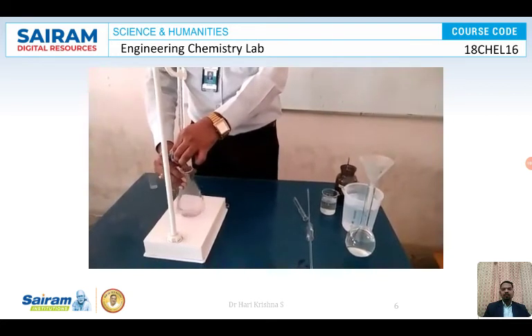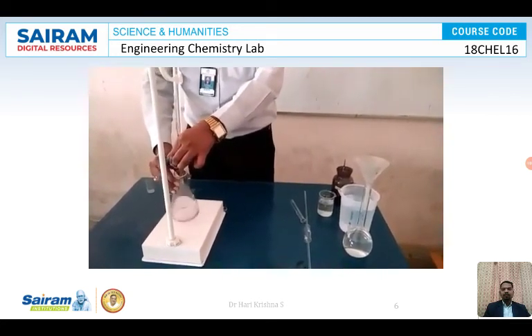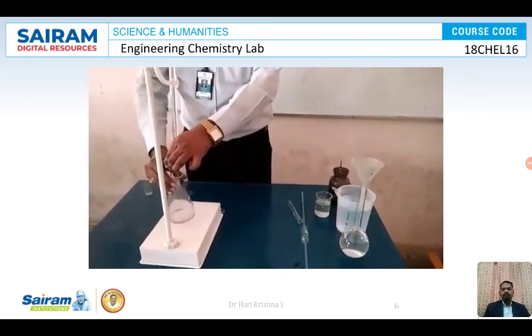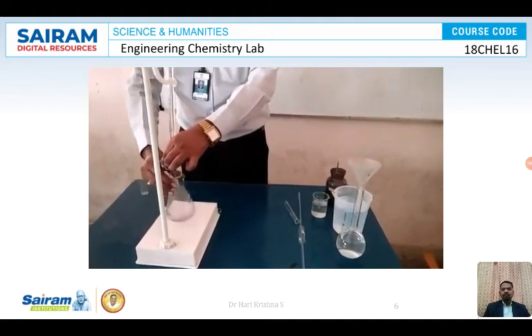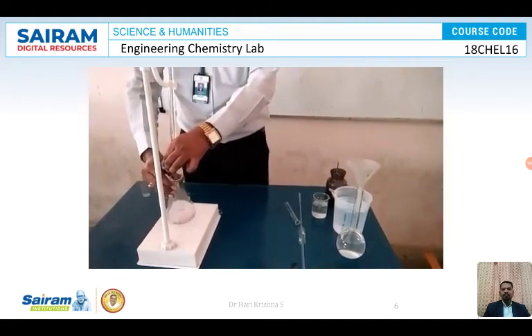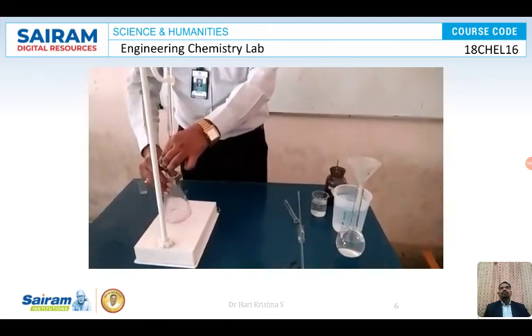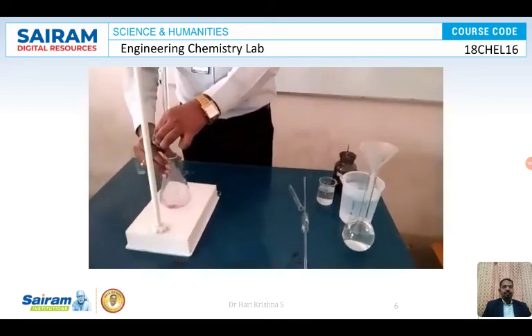You are supposed to control the knob with the left hand, and hold and shake the conical flask with the right hand. With continuous shaking and continuous addition, you will get the end point.